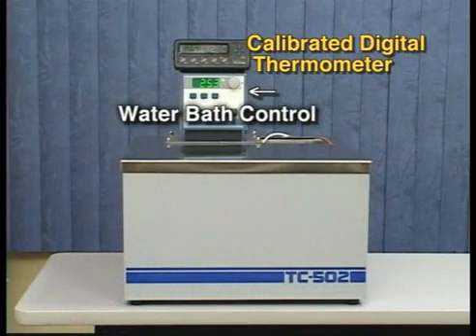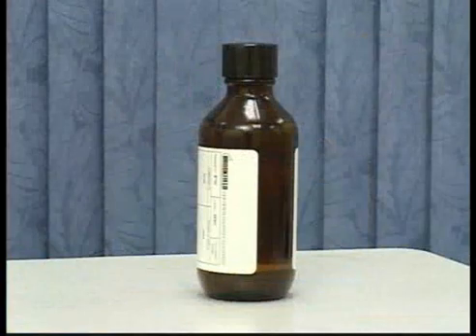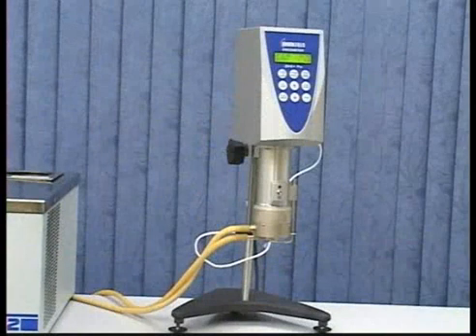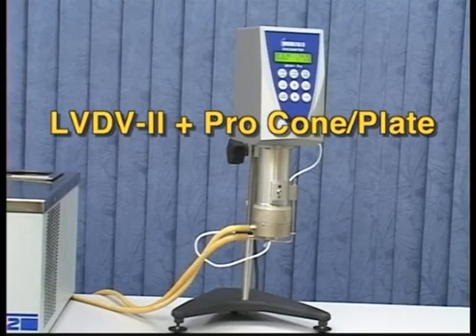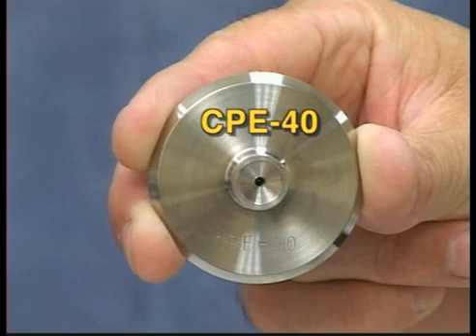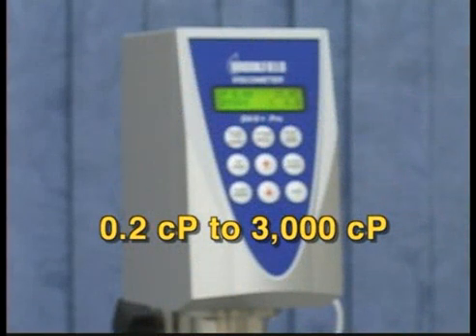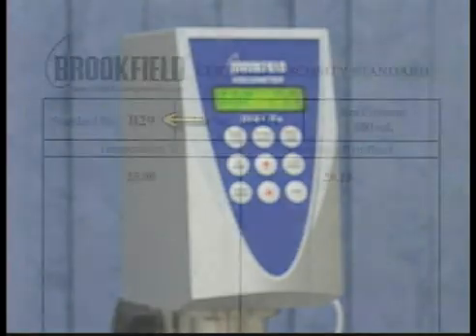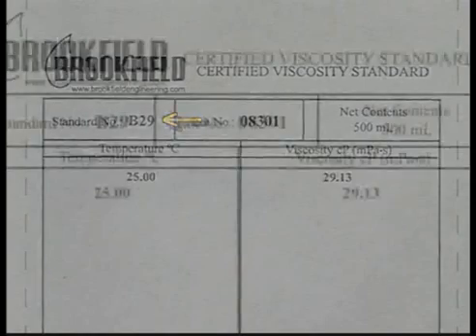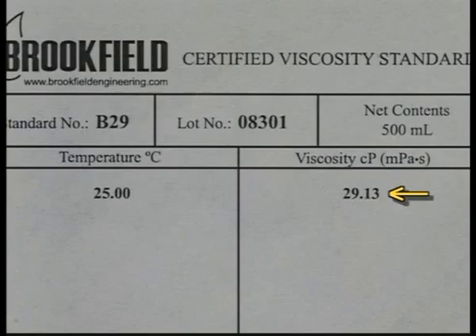You will also need a water bath for temperature control. Select a viscosity standard fluid based on the torque range and model of your instrument and the spindle you will be using. For this example, we will use an LV Torque Range DV2 Plus Pro cone plate instrument using a CPE-40 cone spindle. The viscosity range for this setup is 0.2 to 3,000 centipoise, and we will use a B29 mineral oil viscosity standard with an actual value at 25 degrees Celsius of 29.13 centipoise.